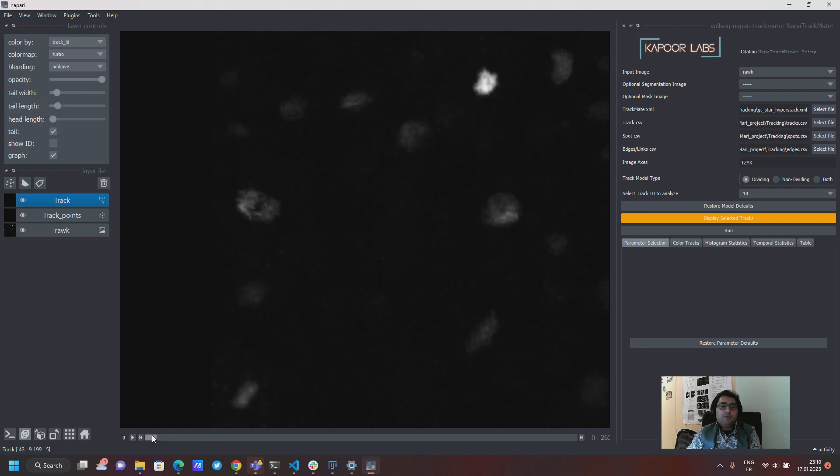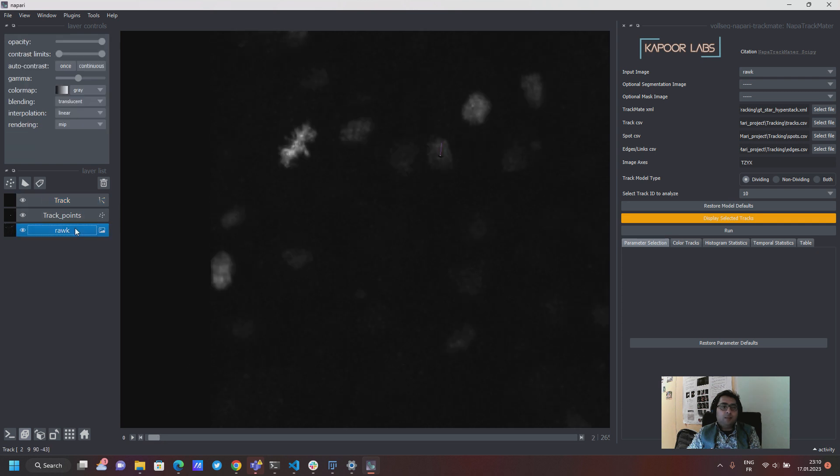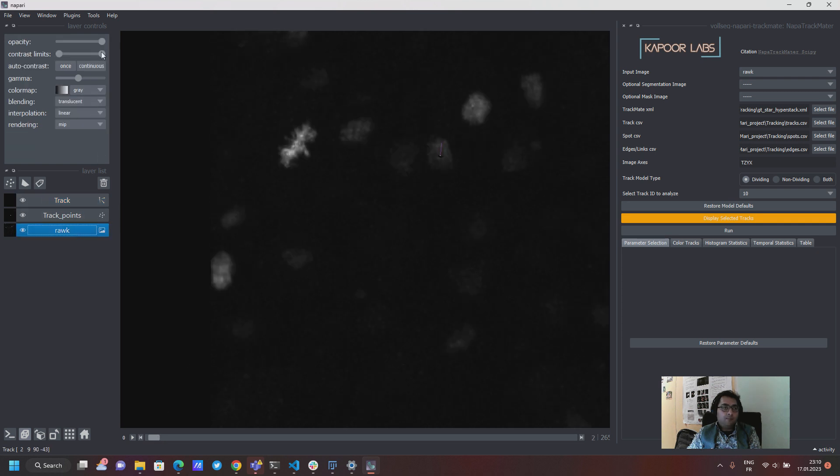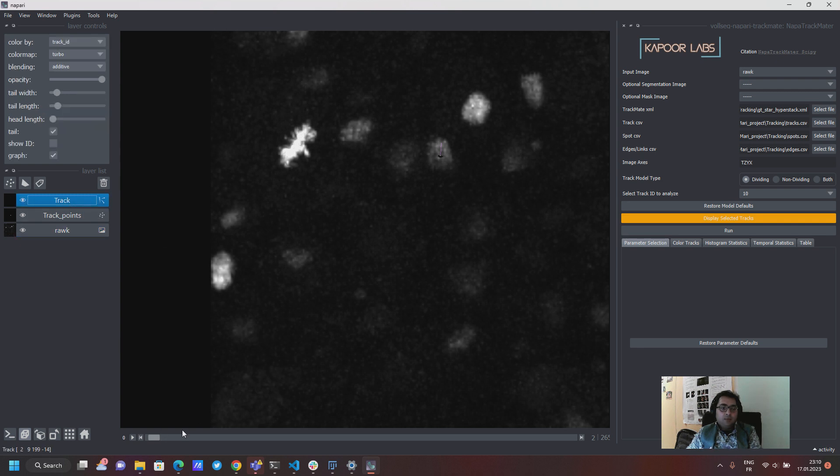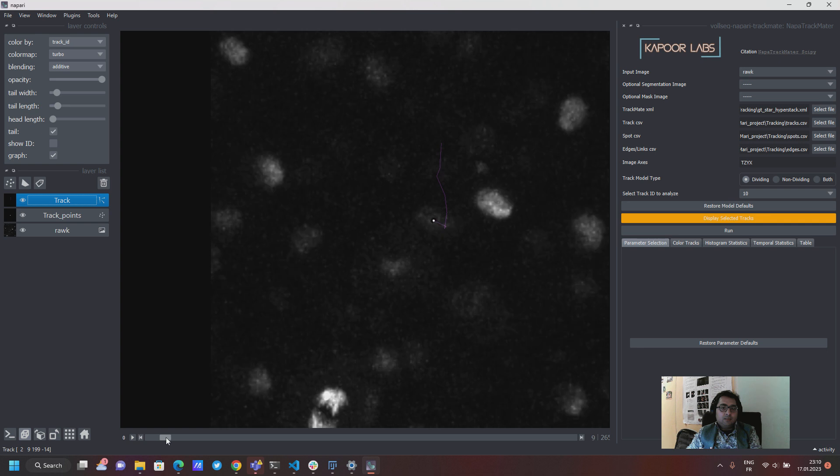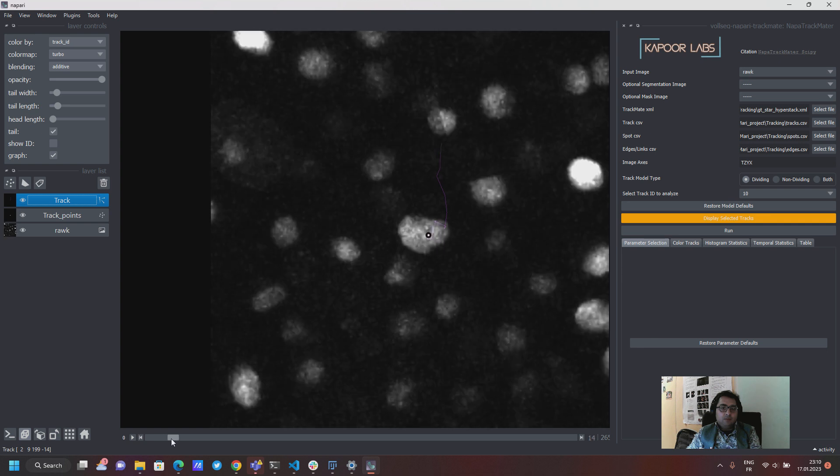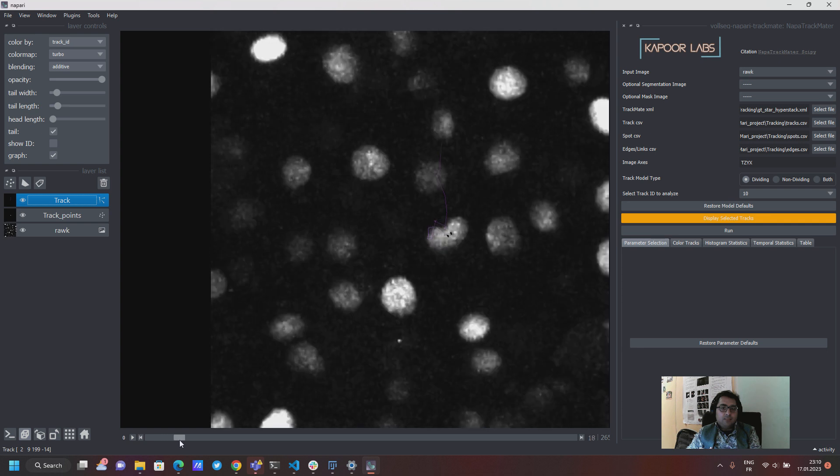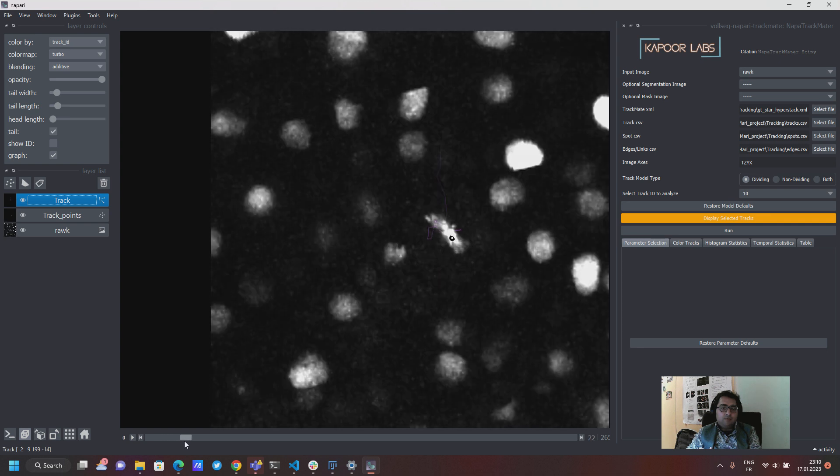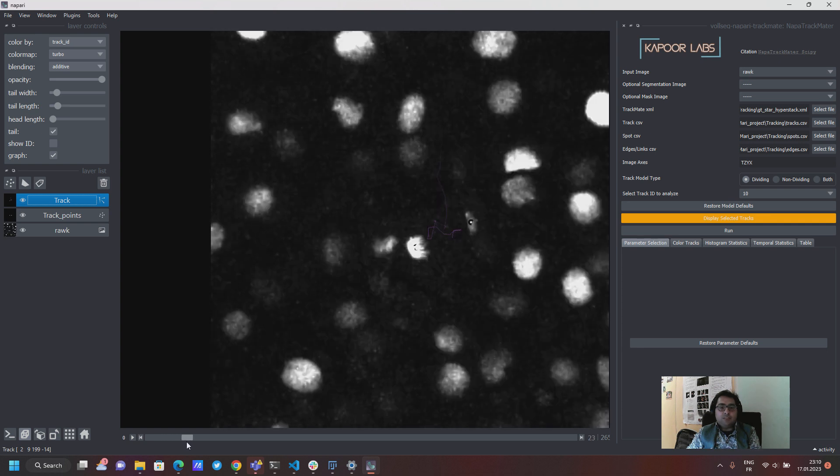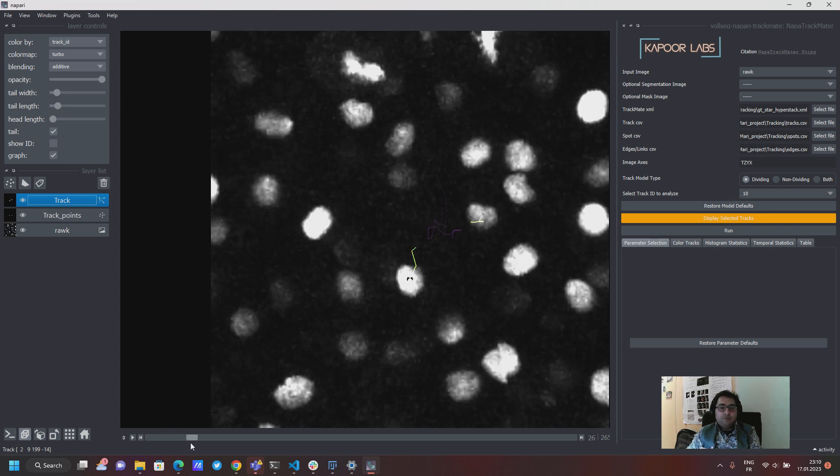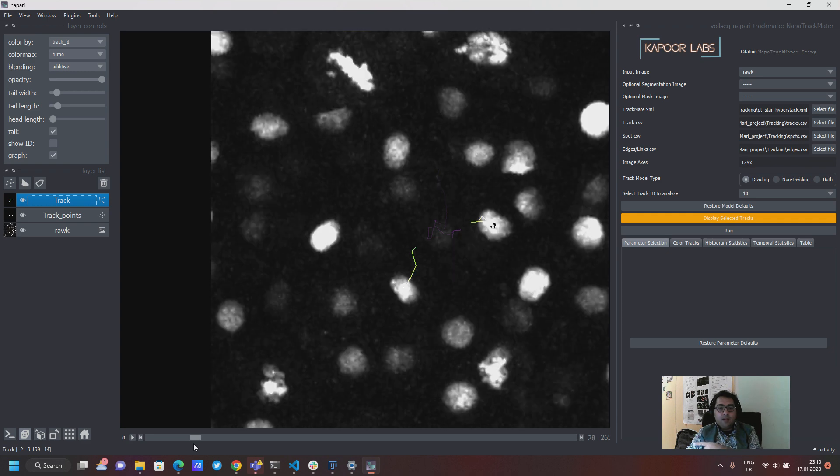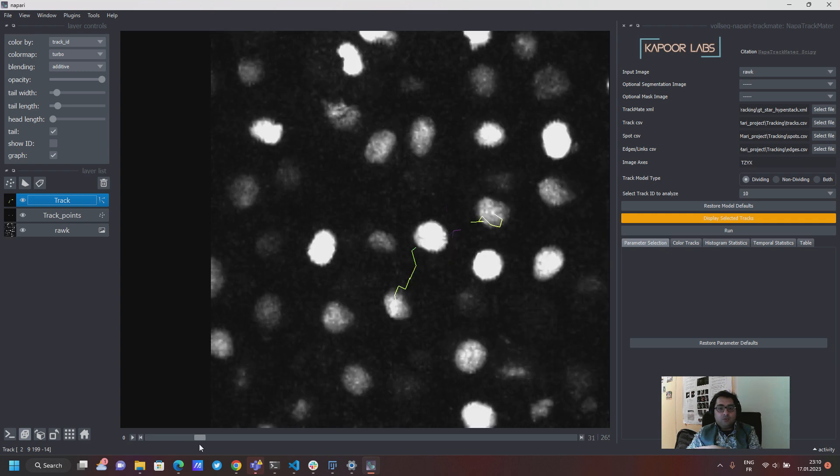So this is the tracks layer of Napari which has been there for a few versions already and now you can see these tracks. For the division you can see the cell which is being tracked by TrackMate and now you see it being visualized in Napari.